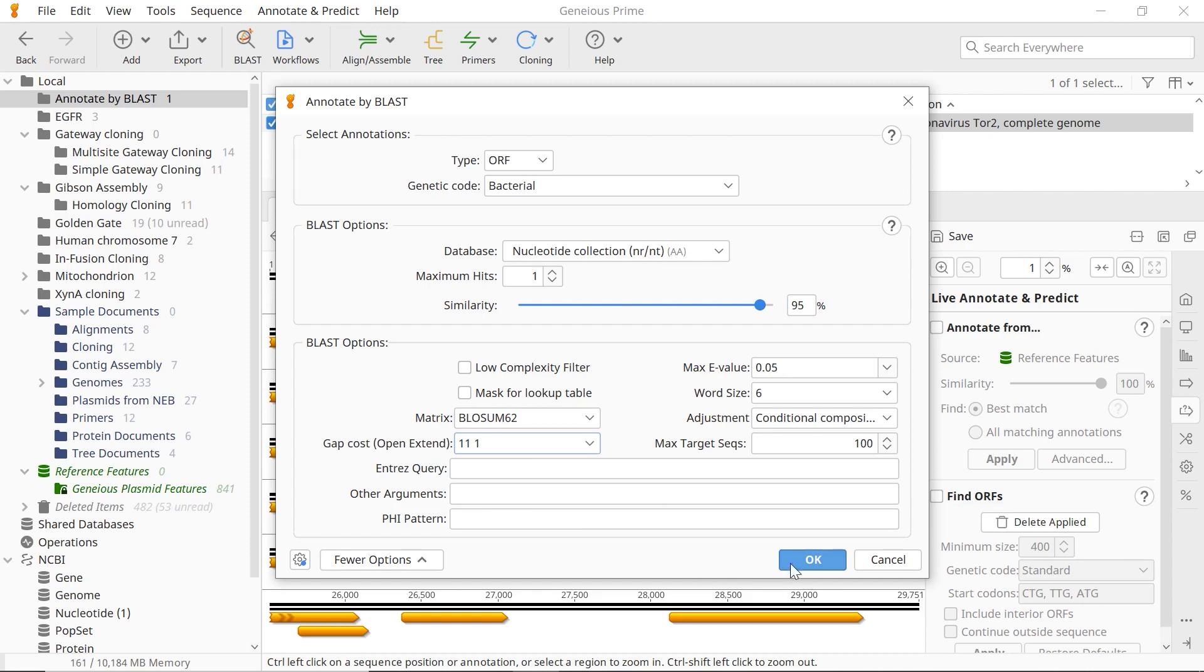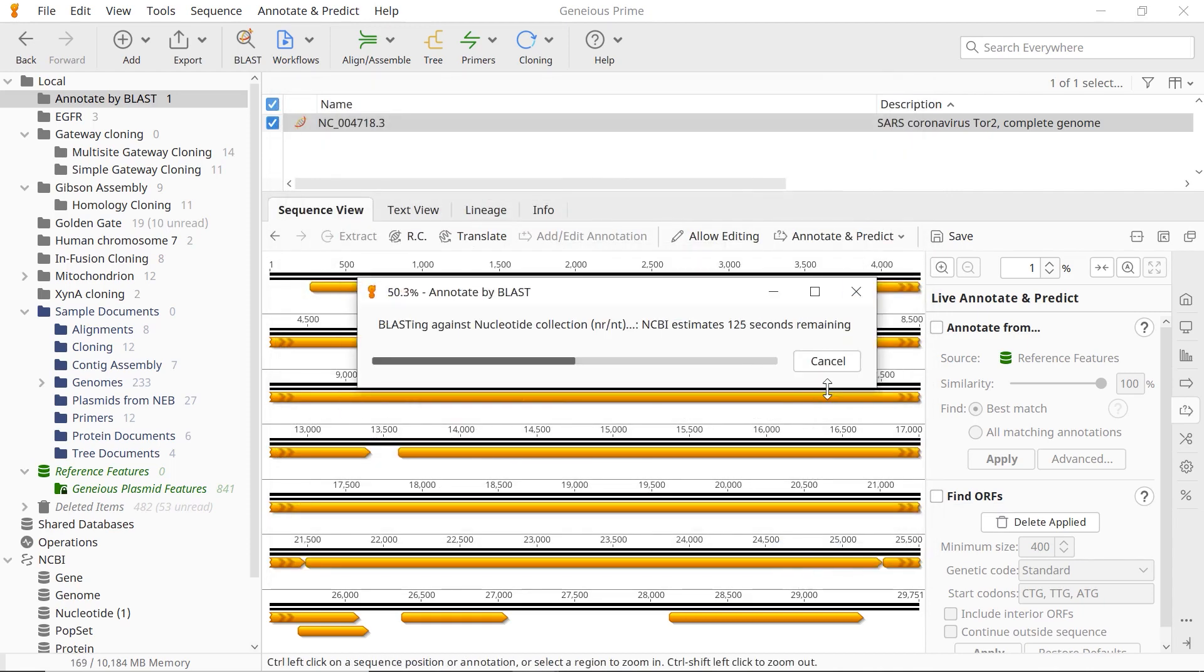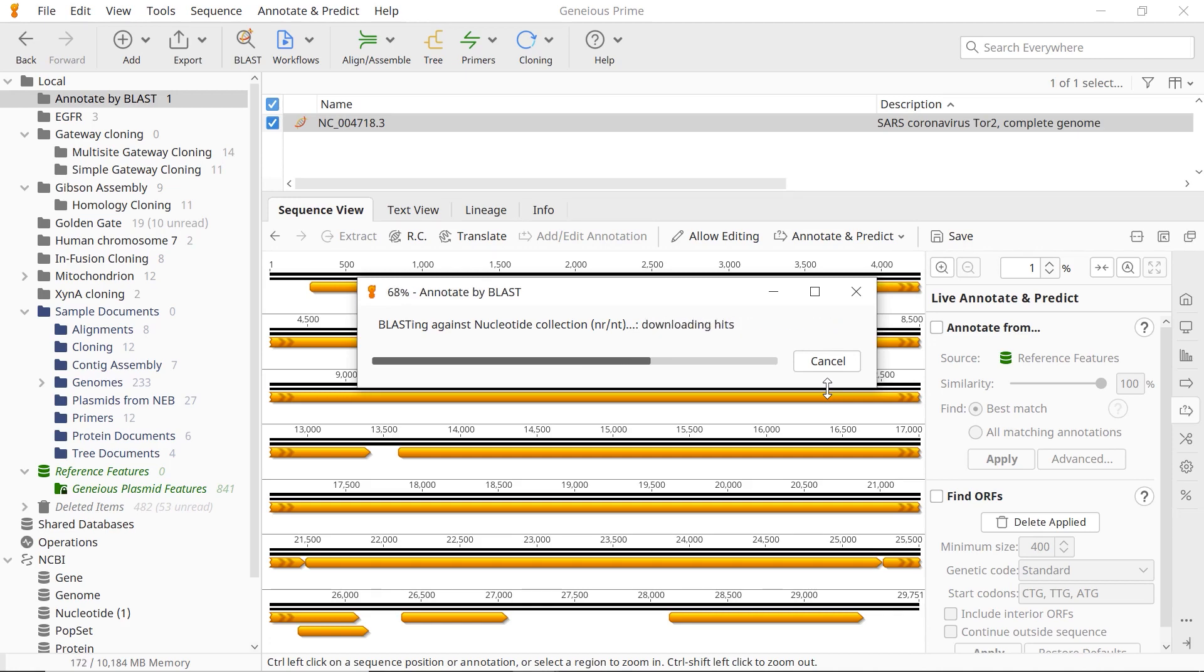Once you're happy with your settings, click OK. Genius will find and extract all the annotations of the selected type, translate them, and run BLAST against the selected BLAST database.